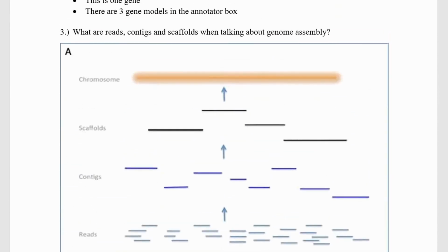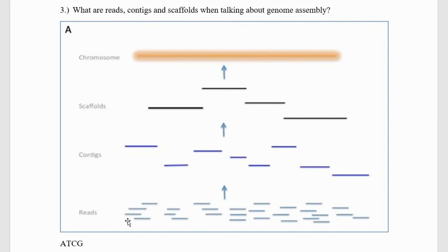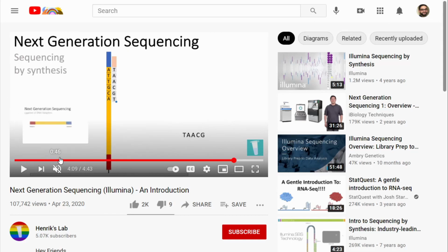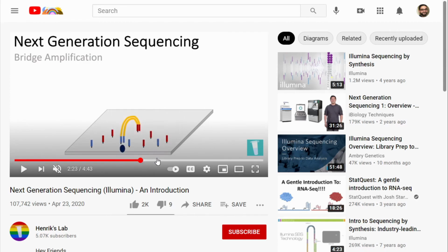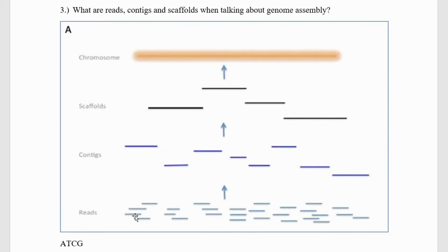When I was talking before in the previous question about reads and contigs, so these reads, maybe this one read, like this whole entire flow cell process where a bunch of stuff is sequenced in unison, this is all done for like one read, right? So all these reads are being sequenced at this one location, and this process has to happen for every single read that's going on. Each of these is sequenced in this particular way, and all of that information is added up to get our scaffolds in the end, which is kind of interesting.